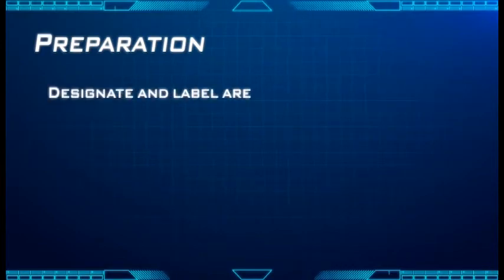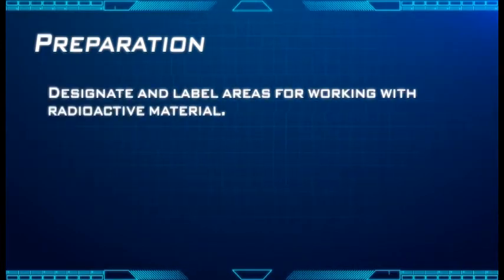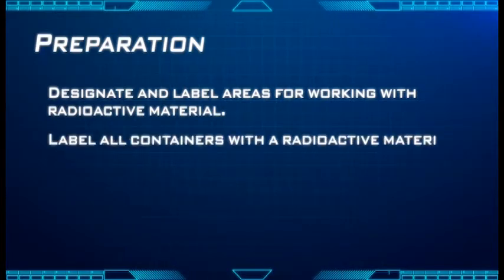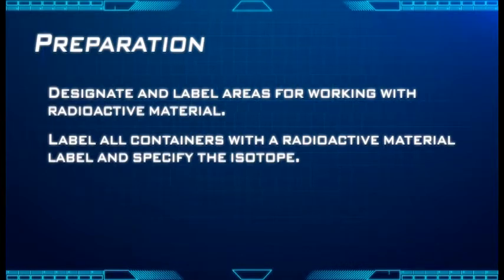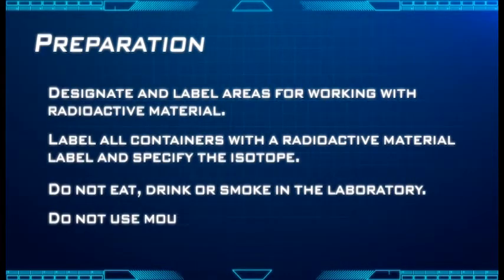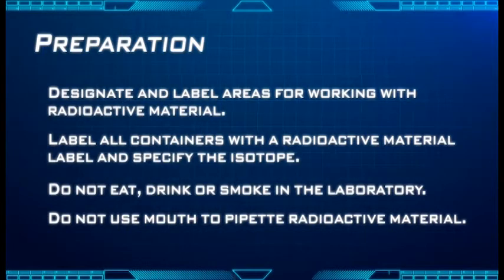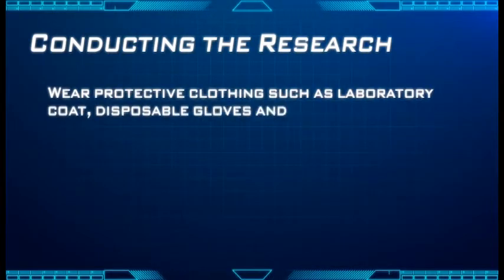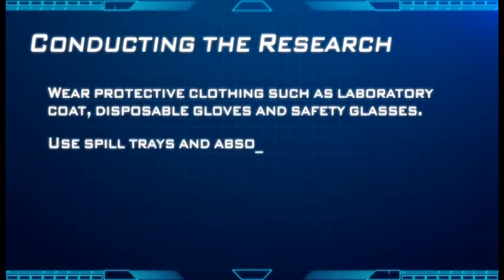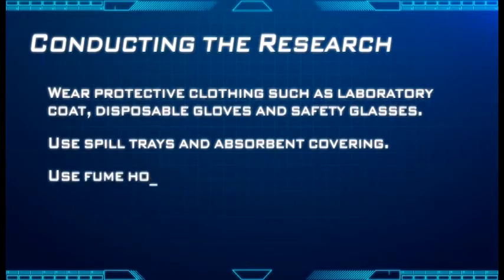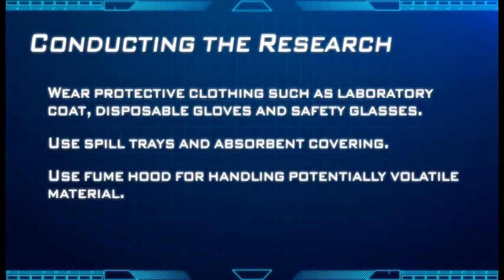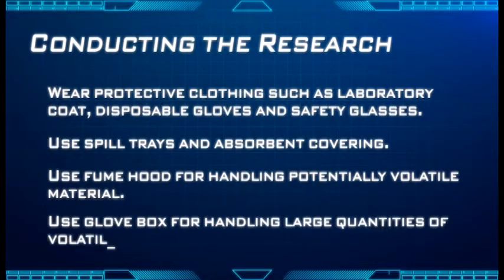Preparation: Designate and label areas for working with radioactive material. Label all containers with a radioactive material label and specify the isotope. Do not eat, drink, or smoke in the laboratory. Do not use mouth to pipet any radioactive material. In conducting the experiment, wear protective clothing such as laboratory coat, disposable gloves, and safety glasses. Use spill trays and absorbent covering. Use a fume hood for handling potentially volatile material, and a glove box for handling large quantities of volatile material.